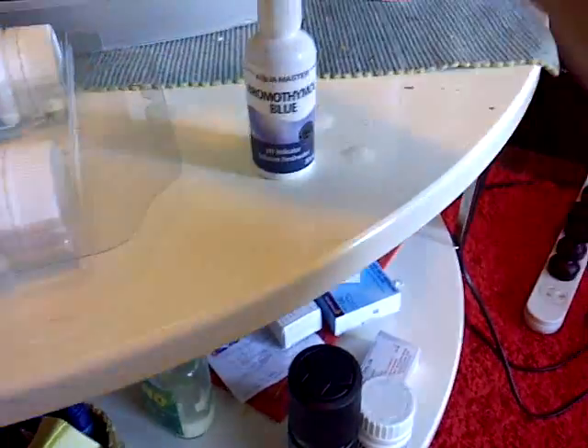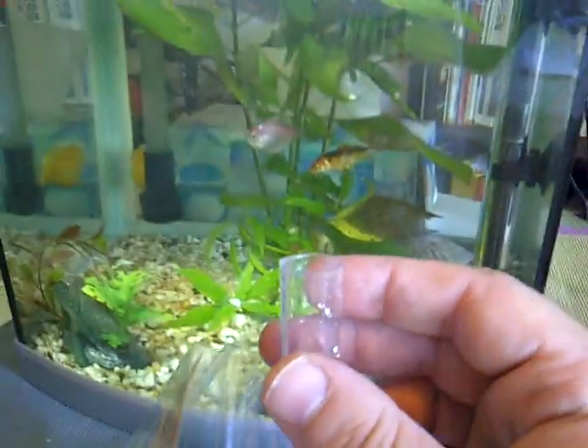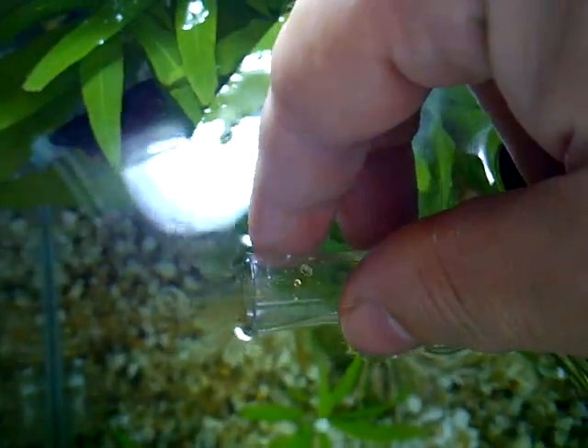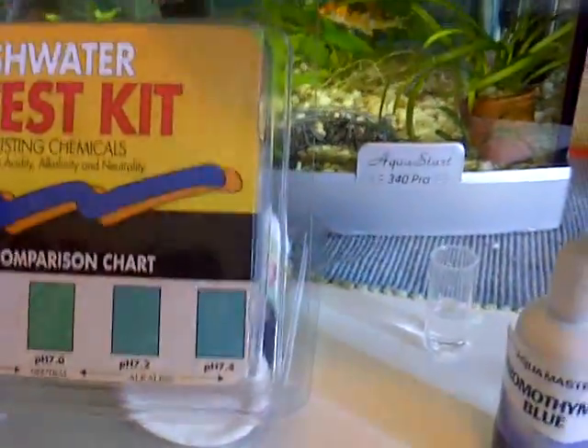What we'll need is this bottle here and of course a testing tube like that. We'll go in and take about half a fill of this testing tube.